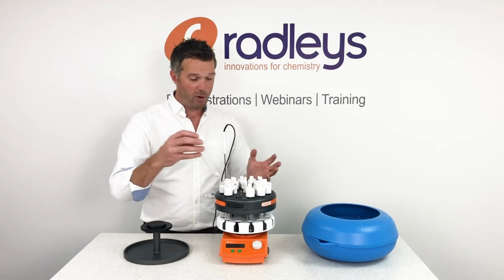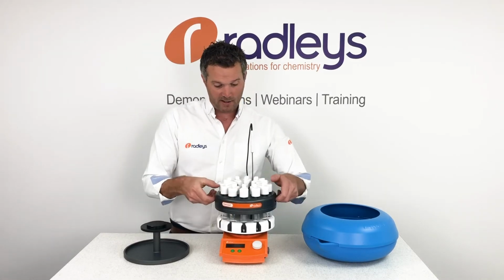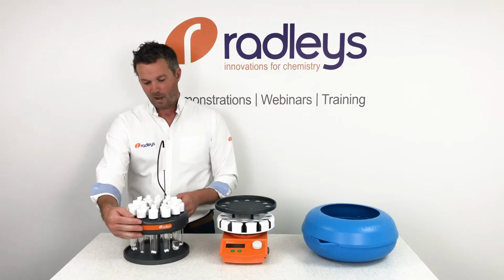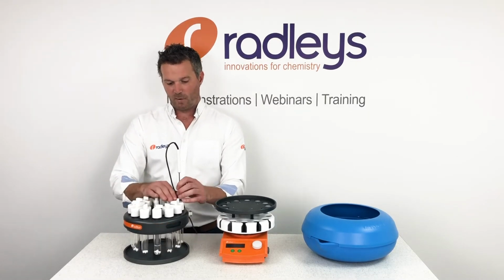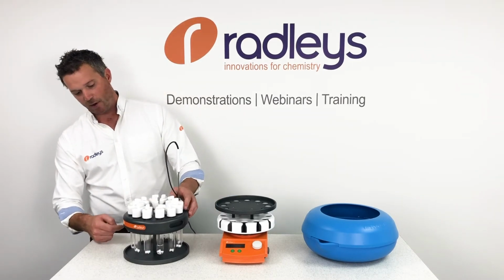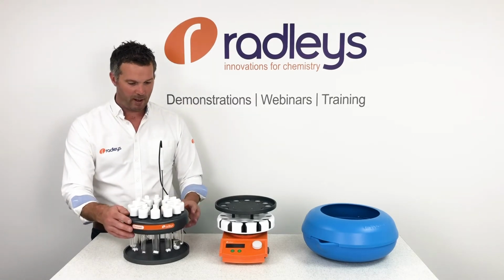So if you wanted to cool your reactions at the end of an experiment to let them cool down, you can just lift off the reflux head and put it onto the stand. It's also quite useful for setting up reactions at the beginning. It's nice to be able to see what's going on in the tube, so I can check I've got all my stirrers in, check everything's loaded up correctly.